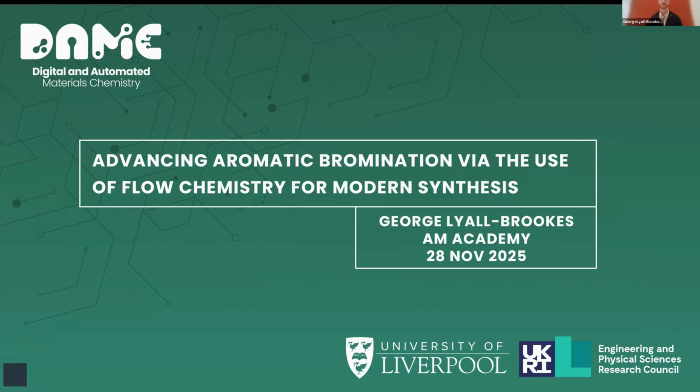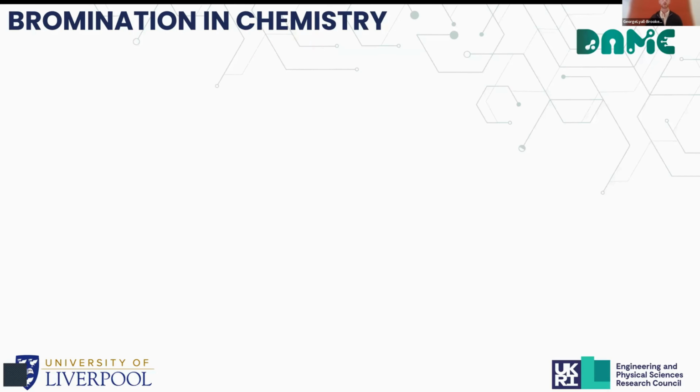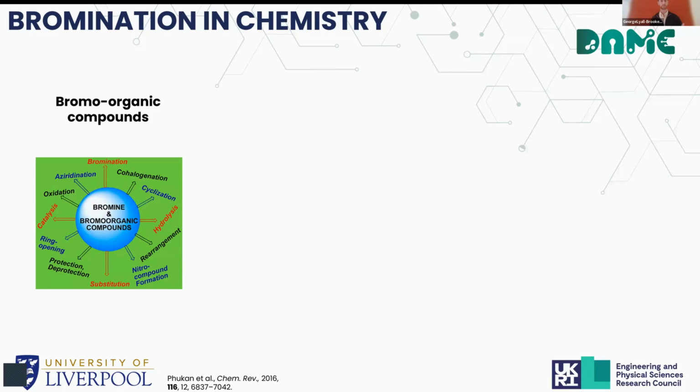As was said, I'll be talking over our recent work on the development of an aromatic bromination procedure in flow. Just to start off, for those not familiar with bromination chemistry, I'll give a quick overview. Here is a figure taken from an excellent and comprehensive review on the use of bromine and bromo-organic compounds in wider chemistry. As you can see, there's a plethora of applications, and it's particularly prevalent in organic chemistry.